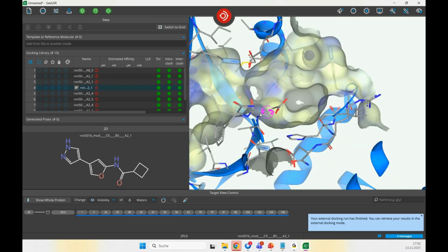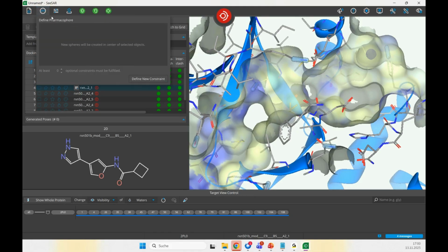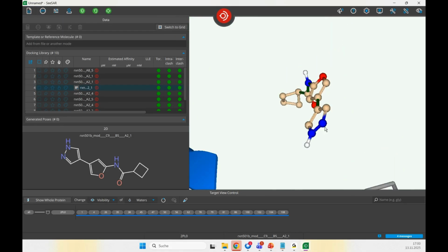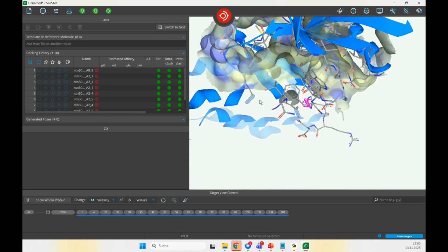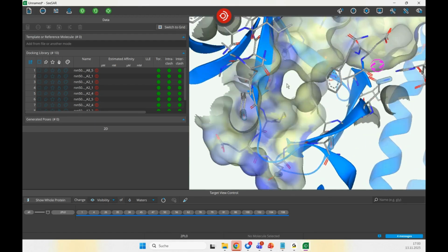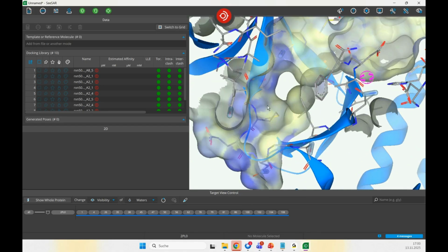For this, I have many settings I can utilize. I can use pharmacophore definitions, defining interactions that I would like to see in my structures. Oops. I have to zoom out, sorry. Binding site. So let's assume I would like to have an interaction with the backbone here.